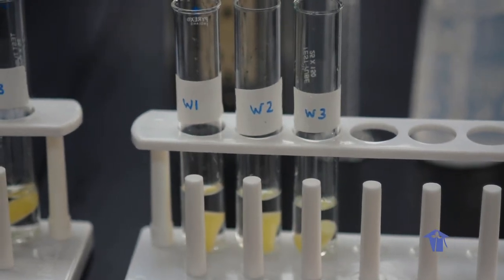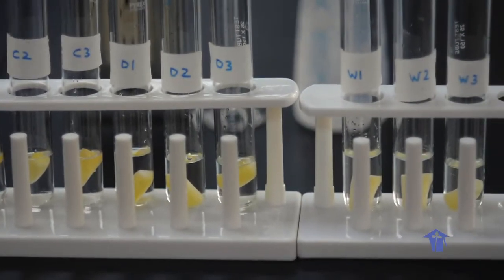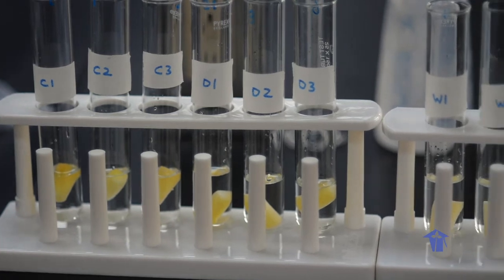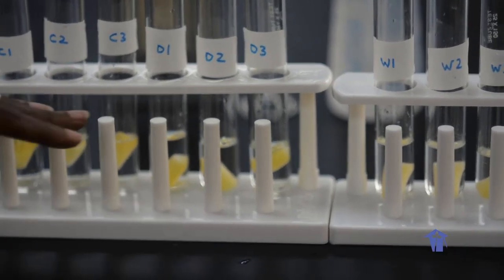Right, so now I'm going to just move these aside, and here we have our 9 boiling tubes set up, so that when we come back after approximately half an hour, we're going to leave the potato strips in here in all of these different solutions, so approximately half an hour.